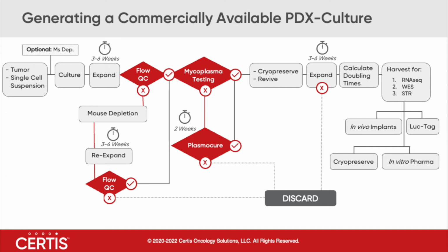Another thing that we do after we've basically taken those steps, we've frozen them, we've revived them, we then send them out for RNA-seq and whole exome sequencing. So that way we can see how closely our PDX cell line matches our actual PDX tumor, just with regard to expression and mutation profile.